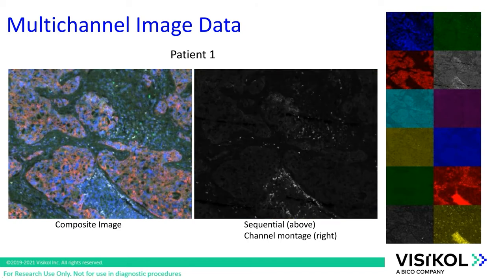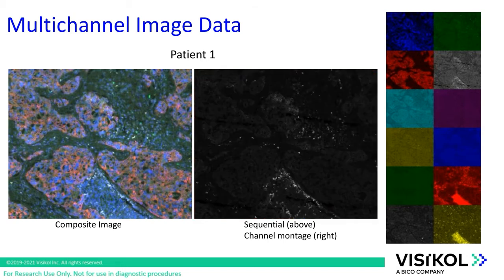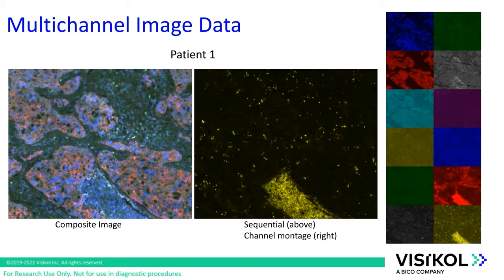The composite image is shown on the left. And in the middle, you're seeing a sequential, essentially video of the different channels going one after the other on the same image. And off to the right, you can see just a montage of that sequence.